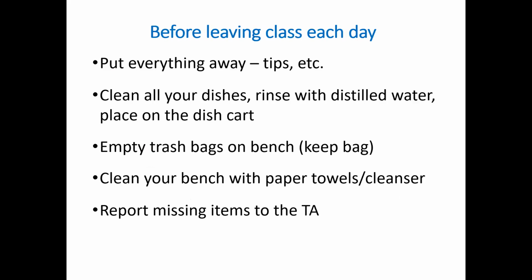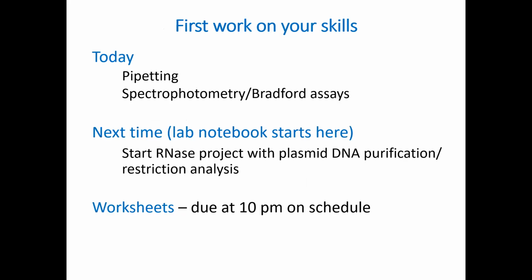Before you leave class each day, you should put everything away. Don't leave tips and tubes and stuff out. Put your pipettes back in the rack. Clean all of your dishes, giving them a rinse with distilled water in the 2 carboys we have in class, and place them on the dish cart upside down to dry. Empty the trash bags that are on the bench, keeping the bag again. Clean your bench with paper towels and cleanser, and report any missing items to the TA.